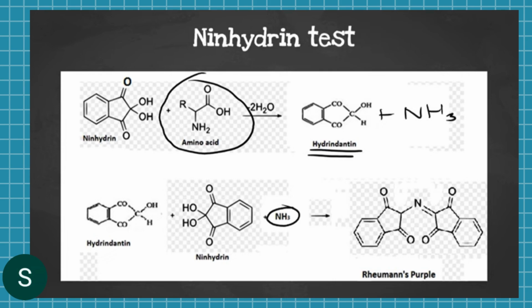So, you have your ninhydrin. So that is your reagent plus yung primary amino acid mo, it would result into your hydrindantin plus ammonia. Okay, ito yung nagiging product niya. So kung mapapansin nyo, yung hydrindantin and yung ninhydrin, it's almost the same. So, ang ammonia, papagitna yan dun sa compounds.